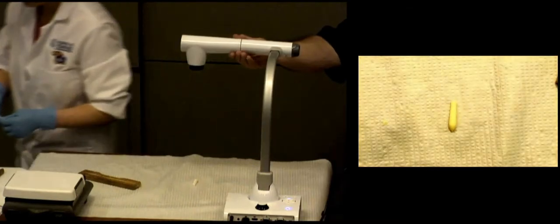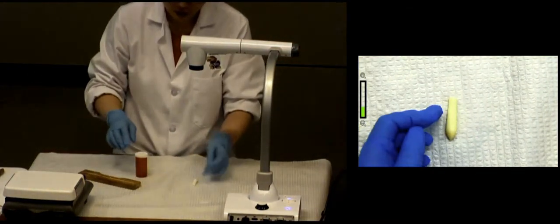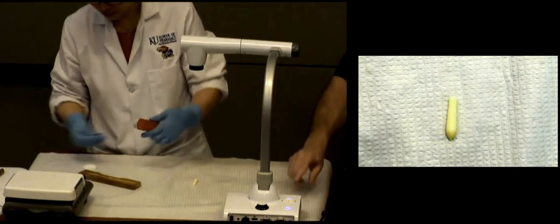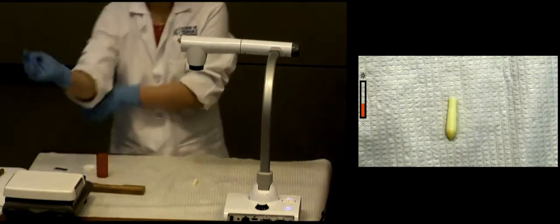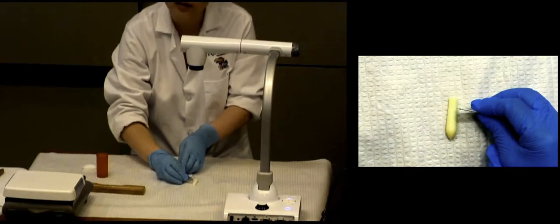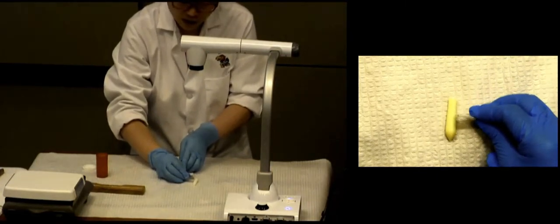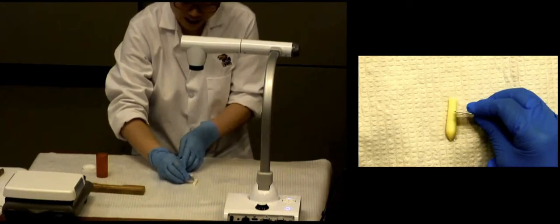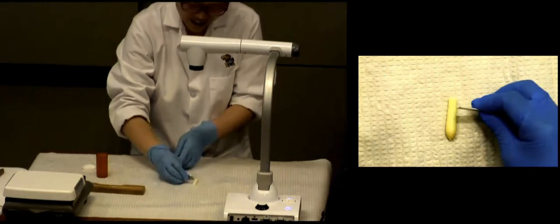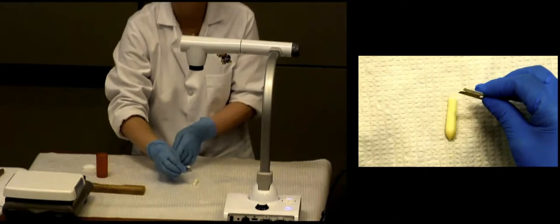All right, so one of them is ready. But remember that we had a little excess on the very top, right? So even from here, can you see the line? So the excess, the line is over here. Can you guys kind of imagine it's there? There's a line there. Okay, and then underneath the line is what you're going to dispense as a suppository, and on the top here is the excess.